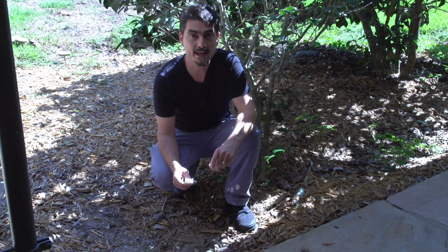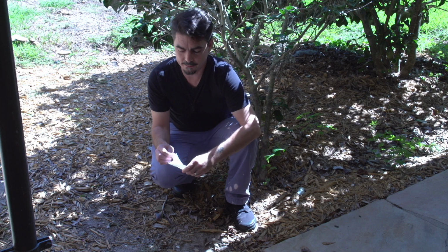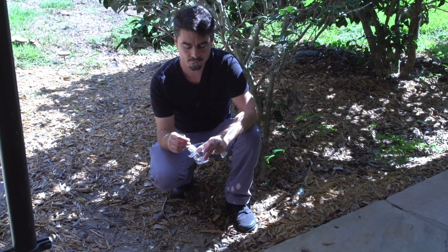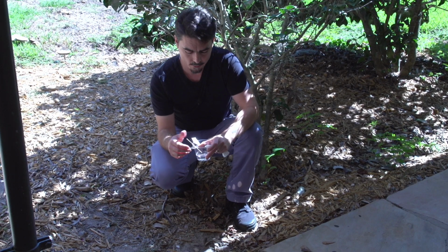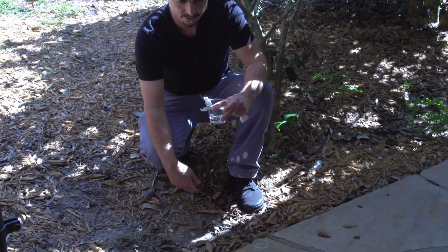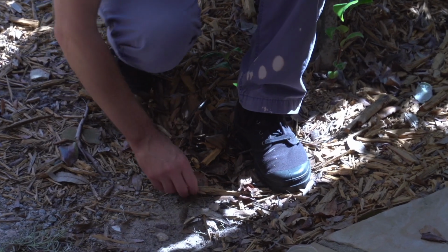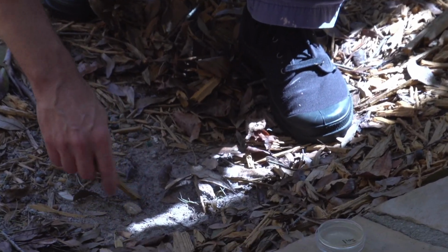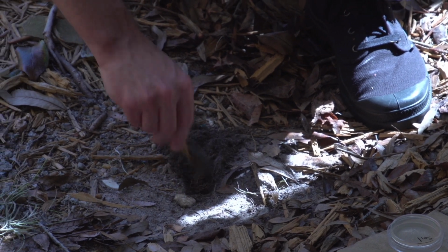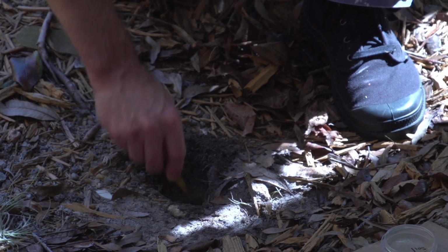Okay, so now we're going to sample from the soil. We need to do just what we've done before. We need to moisten the swab. And this is particularly important for this location because if you look at it, this is fairly dry, sandy material. Often what you'll want is more dark, rich soil. But in this case, since it's fairly dry, I'm going to take a stick around here, trying to get down a little bit more where it's moister, because we want to see the microbes. And we know they're in there. It's just that there's going to be less where it's sandy.